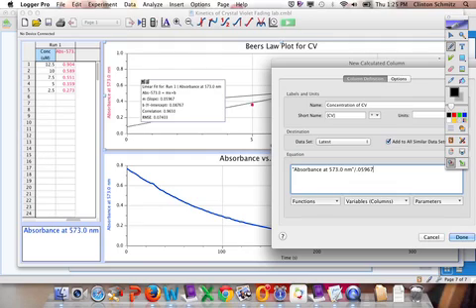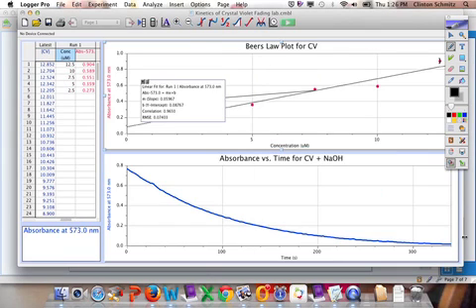0.05967. And basically, when we do that, we're using Beer's Law, where the absorbance is directly proportional to the concentration, but doing it this way, it ends up calculating the concentration. So we'll hit done there, and hopefully, all right. Now that put that in there for us.